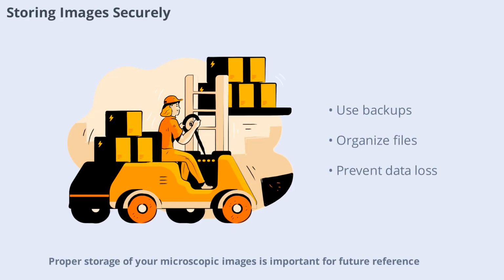Proper storage of your microscopic images is important for future reference. Use reliable storage solutions such as external hard drives or cloud services and organize your files with clear naming conventions.